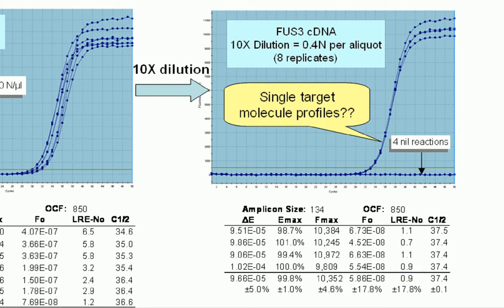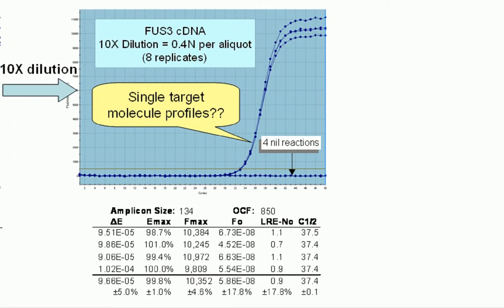In addition, although I will not attempt to present more details, the tight clustering of single molecule profiles has been found to be characteristic of high-performance amplicons. Thus, in addition to verification of quantitative accuracy, this analysis can also be used to assess amplicon performance.